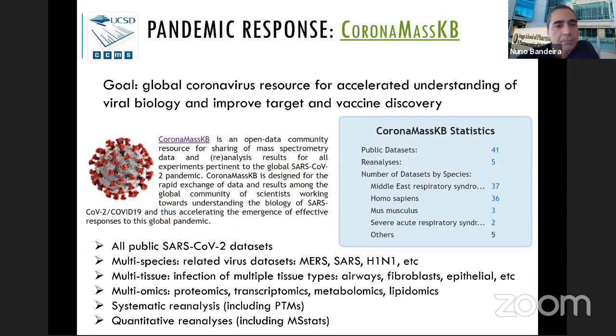And with that, I would stop here and be glad to answer any other questions if we have time and there are any, or we can take them in the next session. But otherwise, our next step is for Meena to actually do a demo of MassIVE.quant and look a little bit more in practice at what it means to upload the data or reanalyze the data. This includes submitting the data sets themselves, but also submitting reanalysis of the data sets using whatever workflow you personally favor. So I think we have a couple of questions, Nuno, if you don't mind.